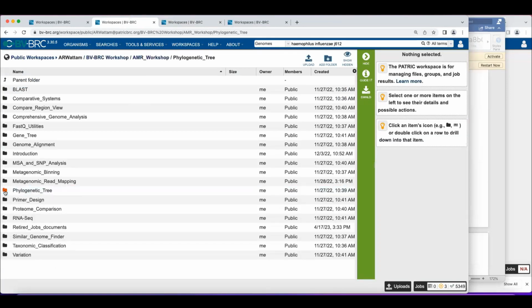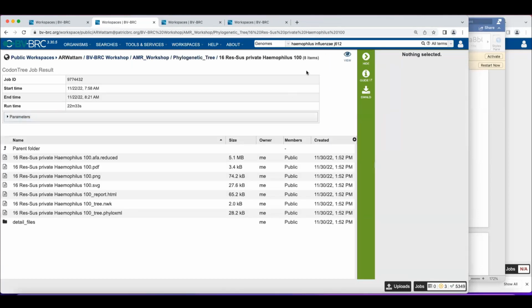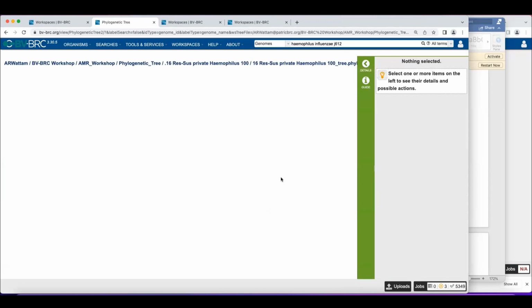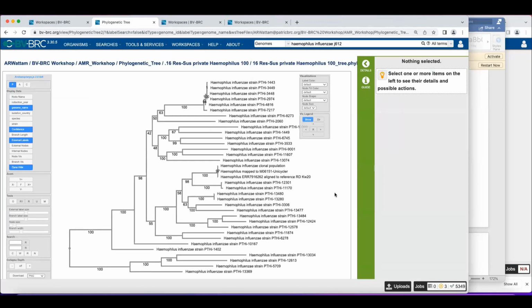Let me just do it here. And I'll do it this way. Because, you know, if you had metadata that you wanted colored, just color the whatever, it doesn't matter. The year. Just pretending that means something. You can download this as an SVG, which I'll show you where to do right here.